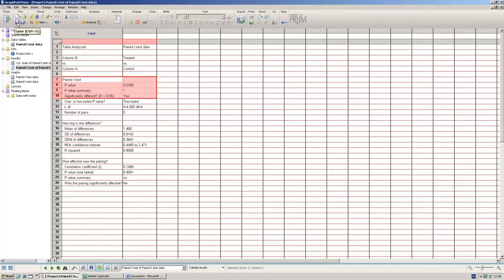One thing worth remembering, when you're saving these, it will obviously save them as a Prism file, which means that you can only open them again on a computer that has Prism. Okay, so please bear that in mind. Again, all the university computers do not have this program. So that's the column data that we're looking at.